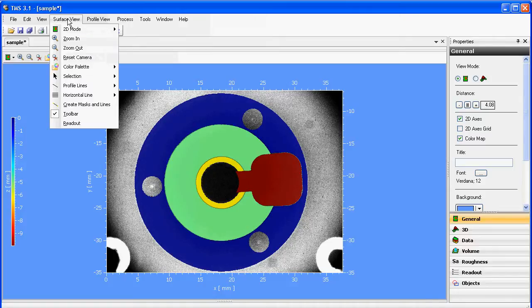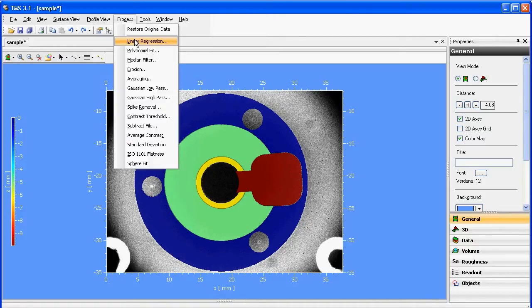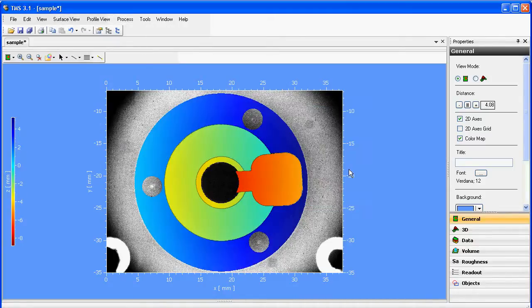The data evaluation can be enhanced with various settings, filter algorithms and profile cuts.